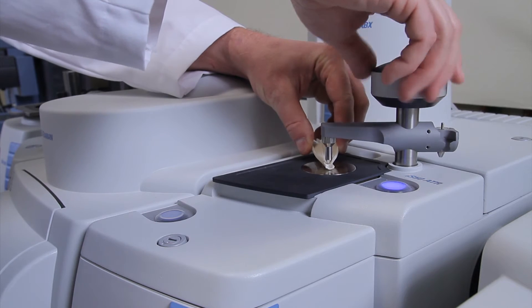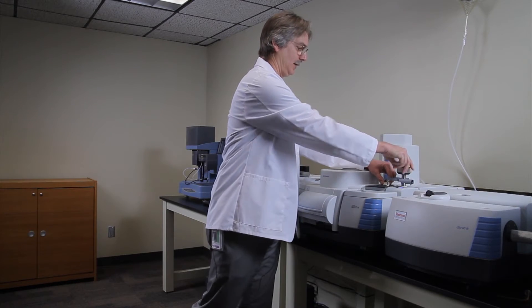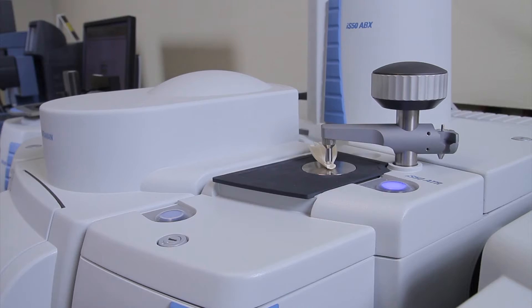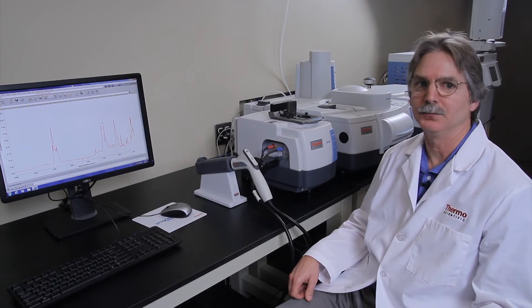All I need to do is put the sample on the ATR, pull down the pressure tower until it clicks, and push the button again. The sample is now being collected and we'll wind up with a spectrum on the screen very shortly. Here on the screen, we have a typical mid-infrared spectrum.